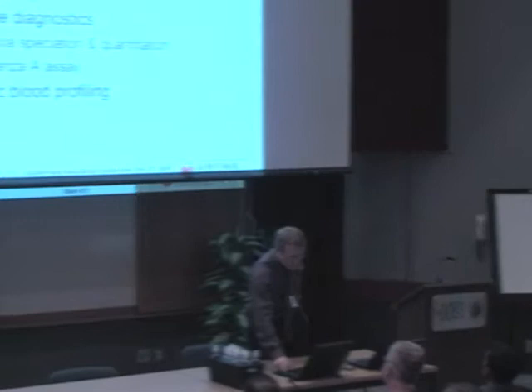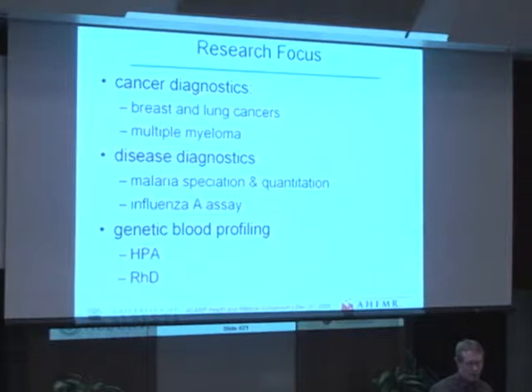So I will skip over this so we can get to these, which are some of the specific applications that we're looking at doing in cancer diagnostics, disease diagnostics, and blood typing.